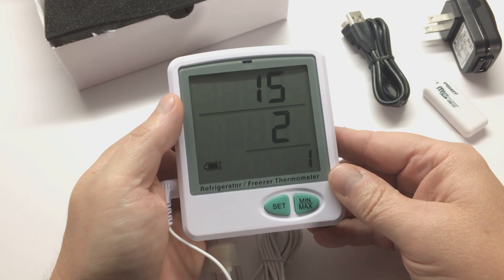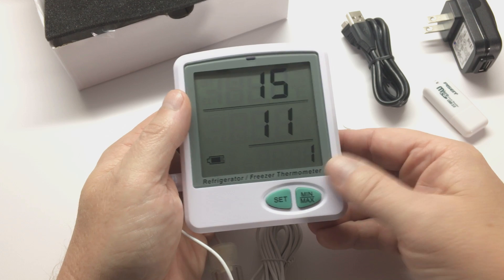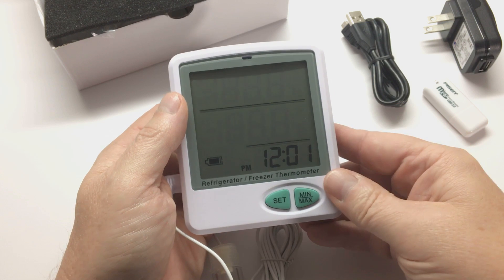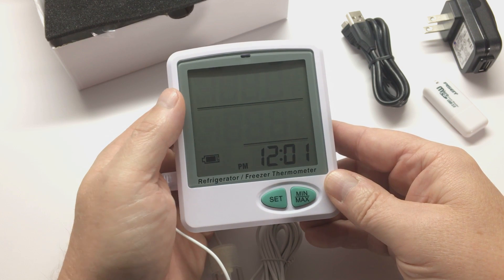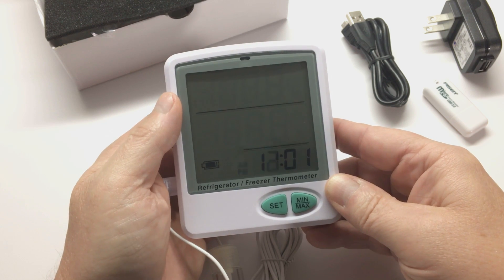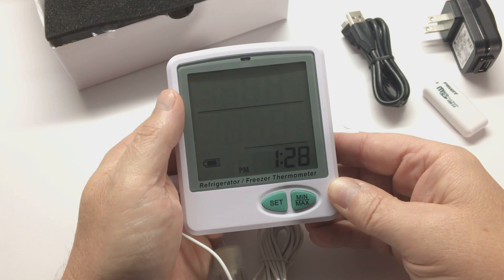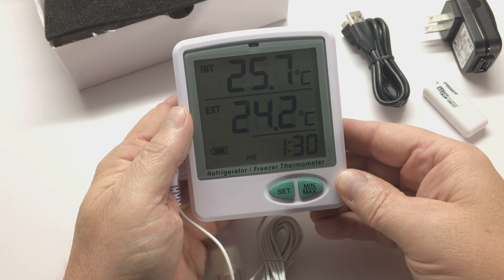The month is 11. Select that. And the day — today is the 13th. And now for time. Use the up and down arrows. It's about 1:30 here. If you go back, you can go to AM. Select that for the hour, and now for the minute. Go to 30. If you depress the button and hold it, it will scroll quickly. Select that. And now we have configured the date and time for the unit.